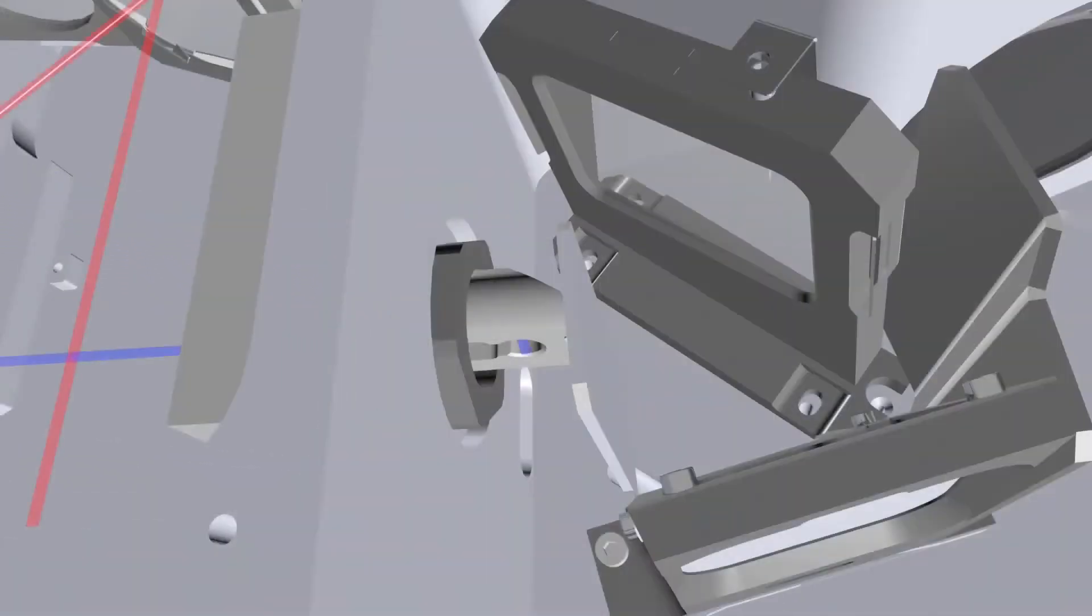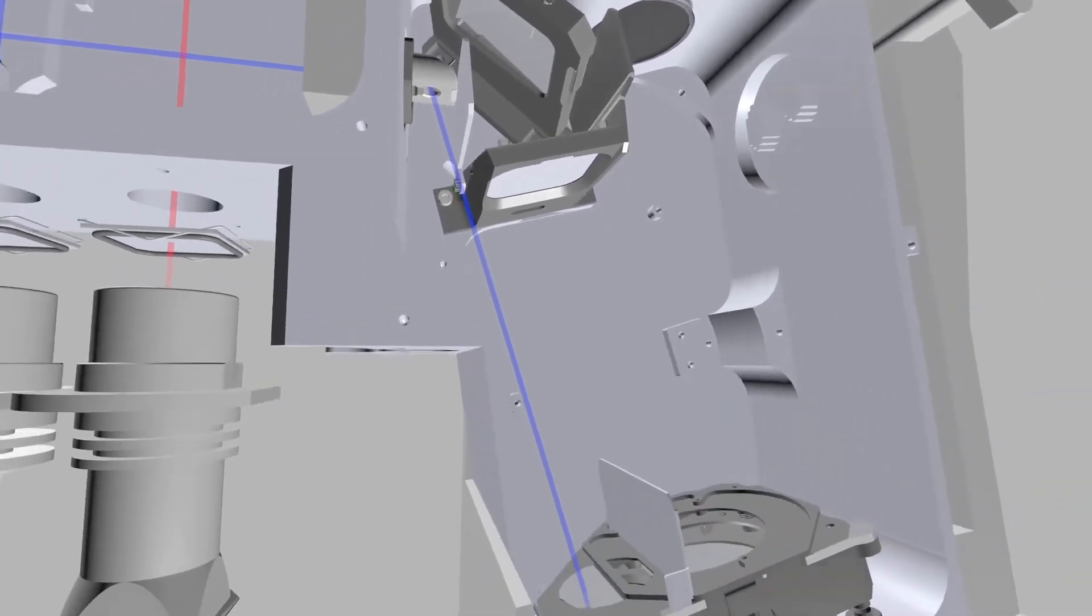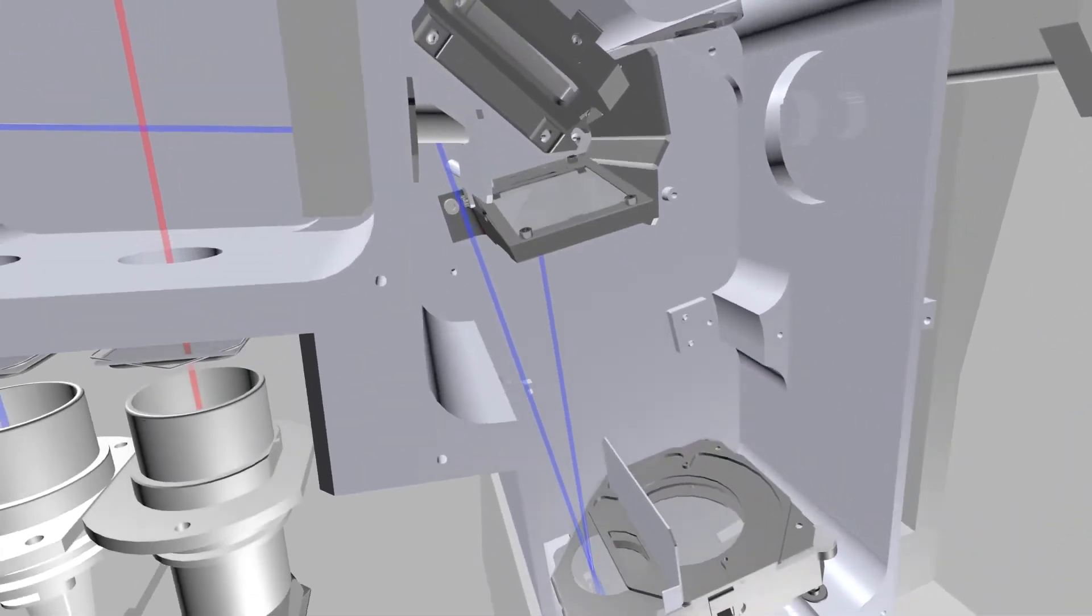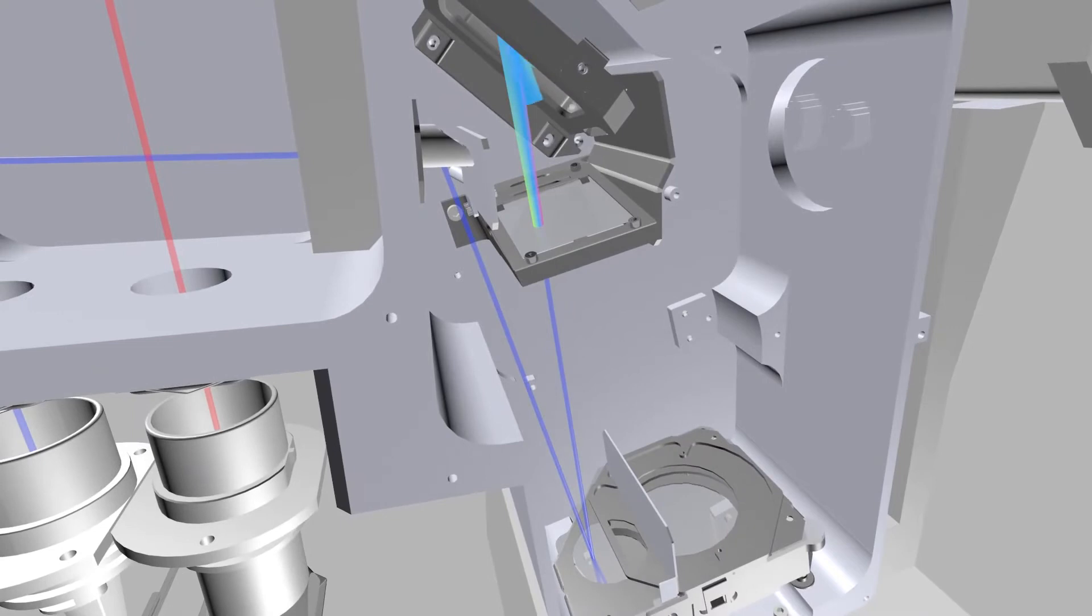This ensures ultimate workflow efficiency. The unique combination of a CID detector and dual pass optics delivers uncompromised sensitivity at high speed.